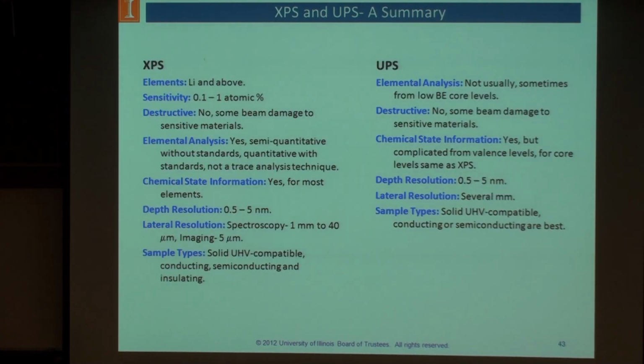Okay, so I'll briefly summarize XPS and UPS. XPS is elementally sensitive. UPS is generally not. Elements that we can see with the XPS are lithium and above.